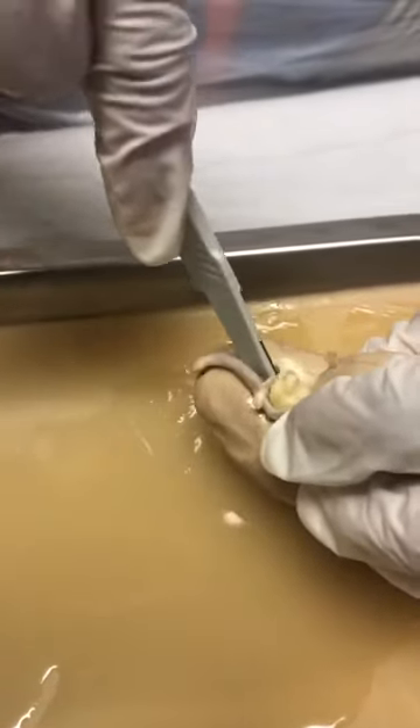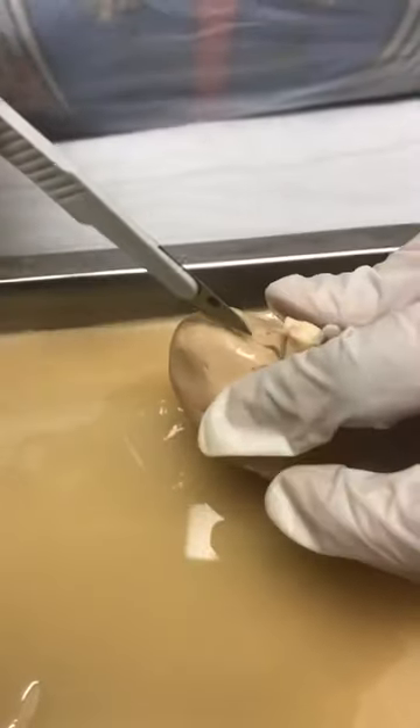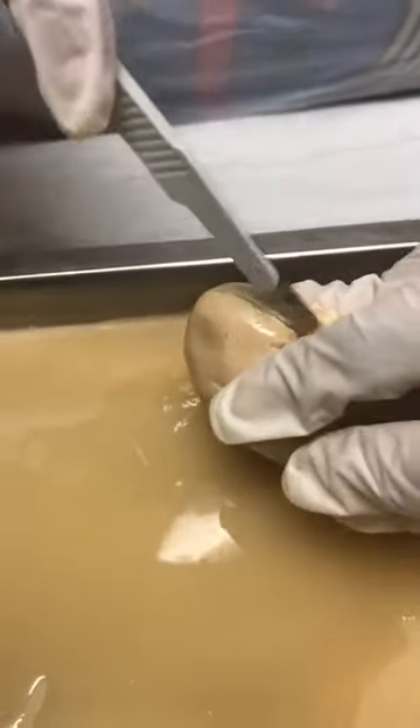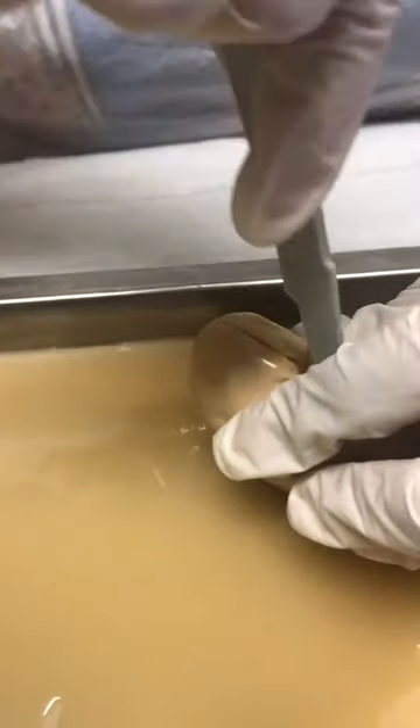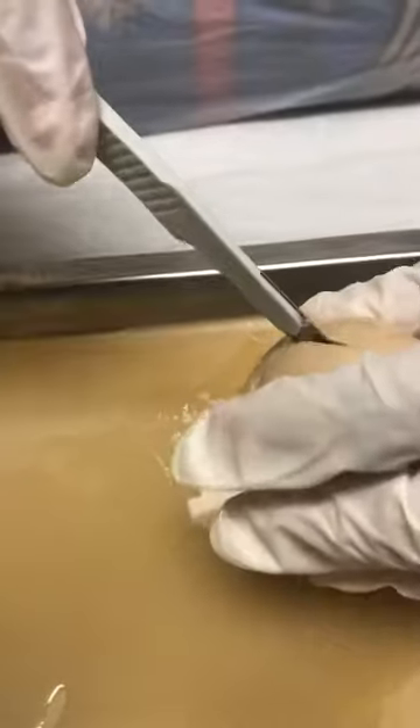I've already cut it partially in half. I had to turn it over and finish cutting it because my scalpel is too short to go all the way through in one slice, and it's kind of thick.